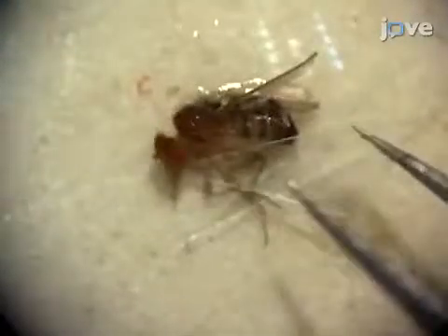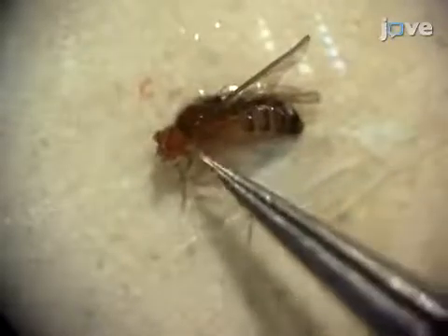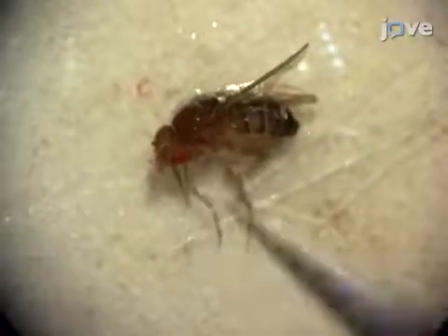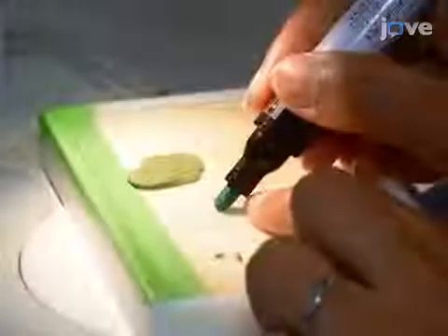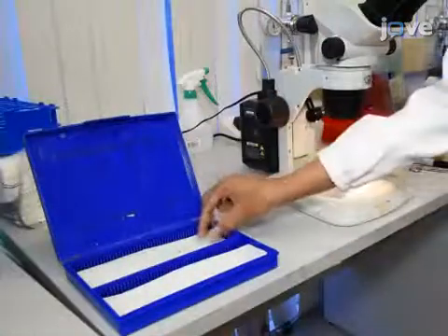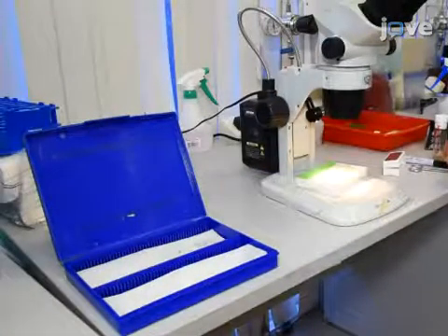If neurons on the proboscis are to be imaged, then place another thin strip of tape over the rostrum of the proboscis to expose the labellum. Now, make a short wall around the fly using a PAP pen. Let the anesthesia wear off for half an hour before taking measurements.